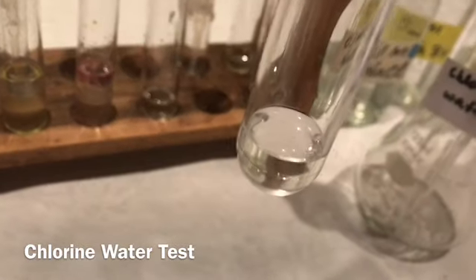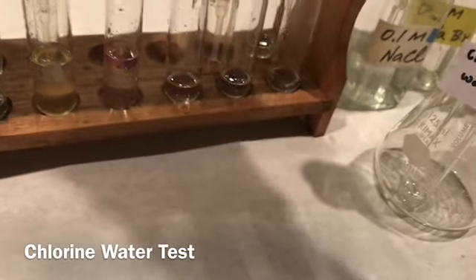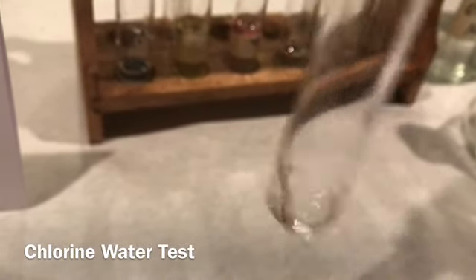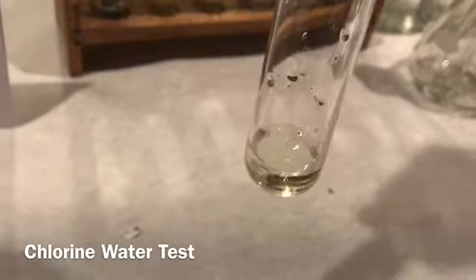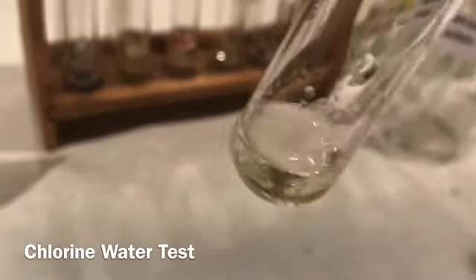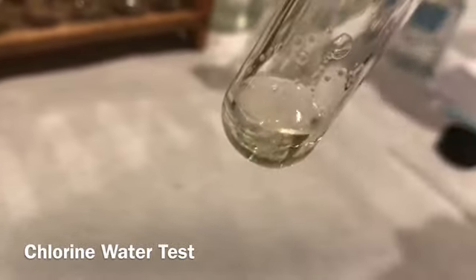sulfate, phosphate, okay, unknown number 1, and here is your unknown number 2. Let me add a couple more drops of hexane in order to raise the volume, so you would have a clear idea.